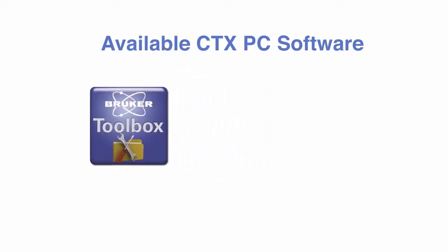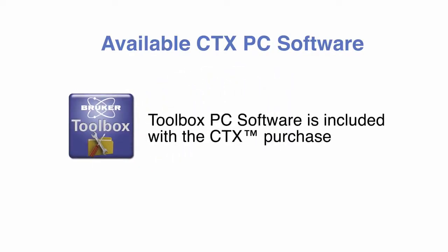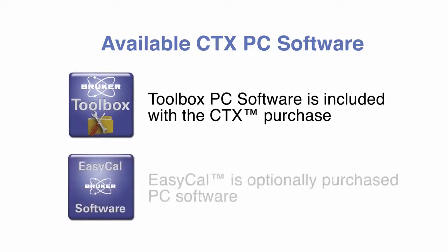Toolbox PC software with remote control and viewing along with Bruker instrument tools is included with a CTX purchase. Optional EasyCal PC software for user-defined empirical correlations is also available.